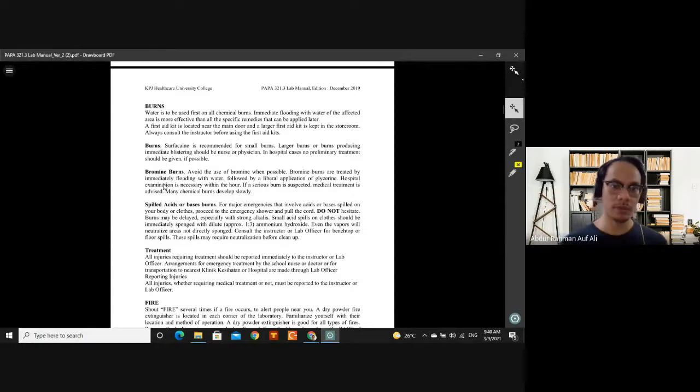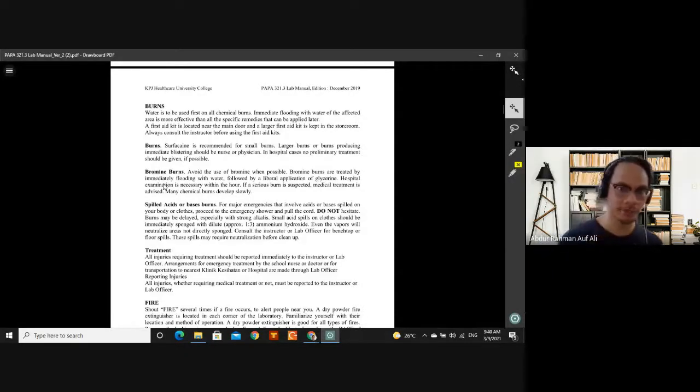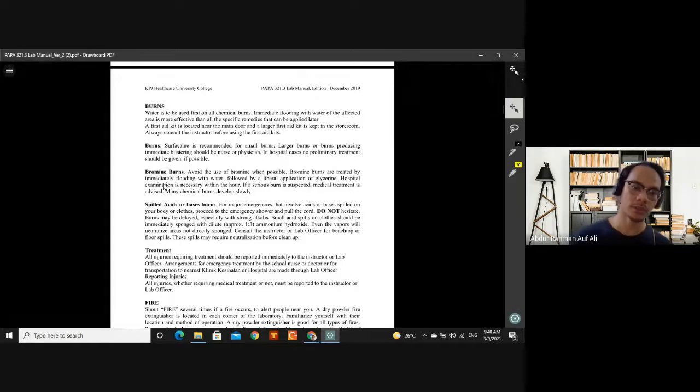If your hair is long, way past the shoulder, the etiquette is to tie it up, and it hangs just above the shoulder. That's the longest. Sometimes longer hair can hinder because you need to move around. Kalau kamu nak kena tunduk, nak kena move to left and right, your hair will hinder your eyesight sometimes, kacau tangan ke, and it can cause spillage. So kita nak kurangkan risiko of incidents.